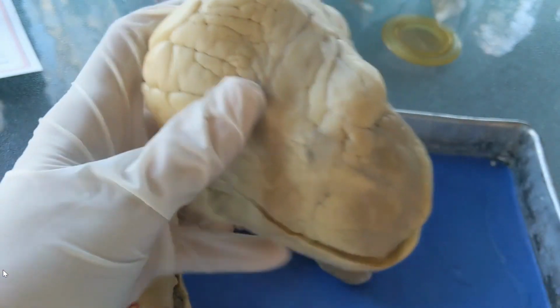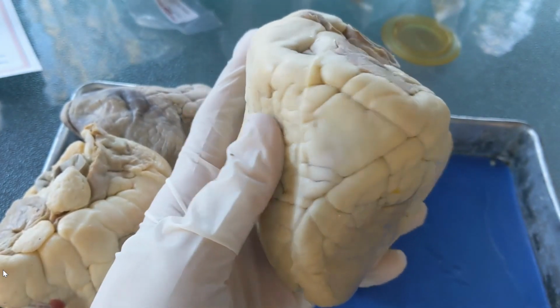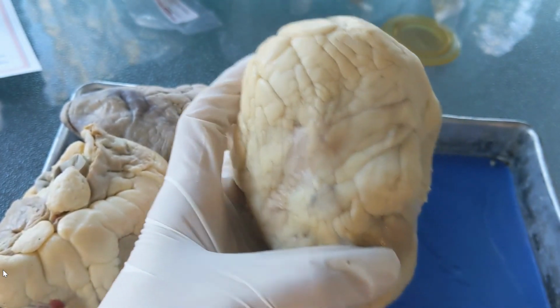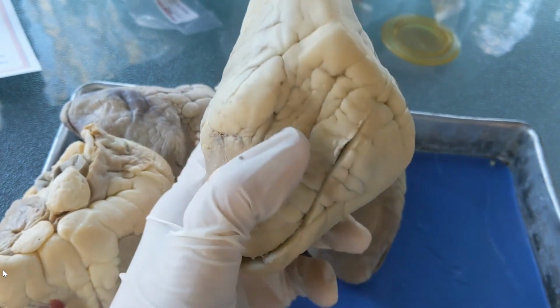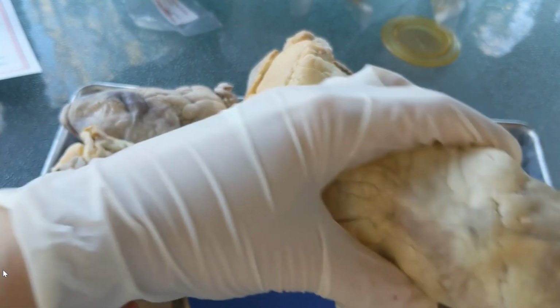And now we come to cardiac case D. This was our 38-year-old male that didn't feel very good and laid down. He had cuts on his legs with signs of infection. Here's the front of the heart. Here's the back of the heart. And then we open that heart up.